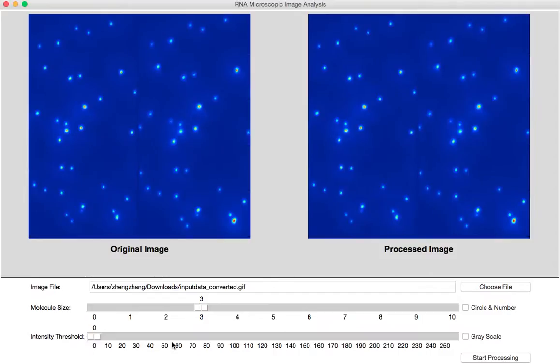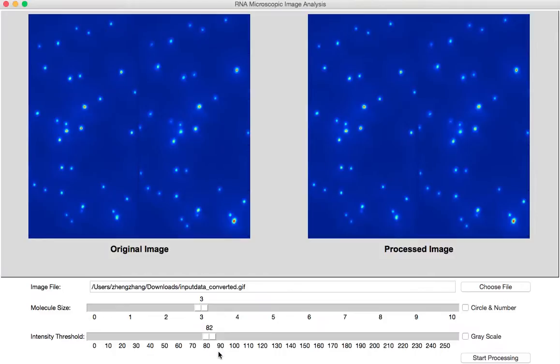Typically the intensity threshold is from 80 to 120. Now we can set a threshold say 82 to eliminate all those background noise with intensity less than 82. Then we can start processing.